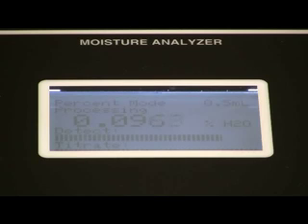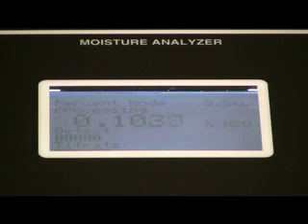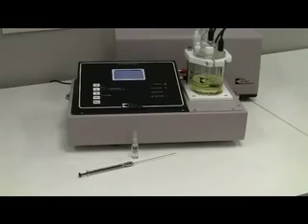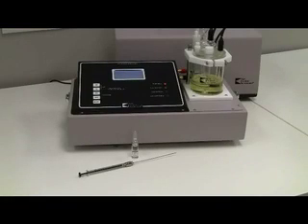When all the moisture is removed, the display will stop counting and you will hear a beep. You are now ready to test a sample.